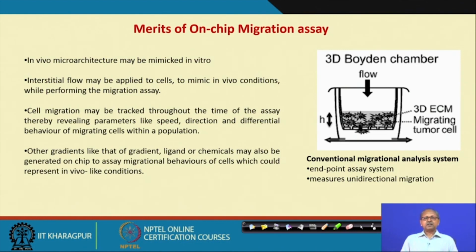So, in a nutshell, microfluidic system based experiments can be used to assay mechanosignal transduction, cellular growth, cellular migration, and many experiments can be designed according to the need of the biological output. I think all these things will give some idea of the importance of microfluidic systems for cell culture and development of assay systems.